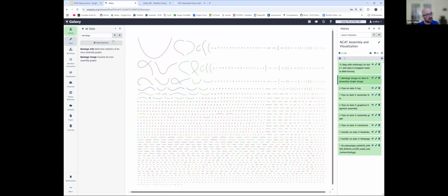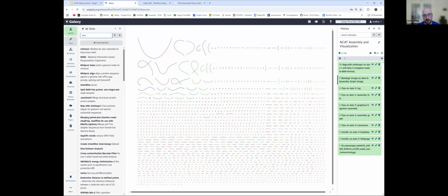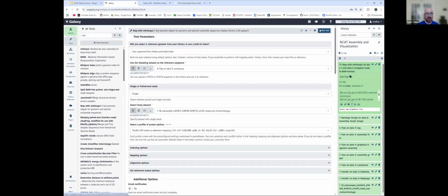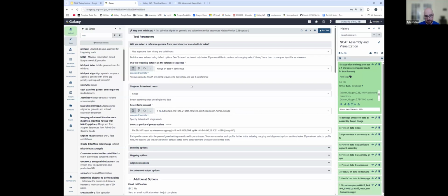So the first thing we need to do is generate a BAM file, because when I moved it down, I did not move the BAM file with us. So we can do that. I guess I'll also show here, whenever you run something in your history, just as an aside, you can always click this little round Ouroboros-looking arrow. That will be a rerun, and it will basically open the tool form populated with every single thing that was used to generate this data, exactly how it was before, so you can see exactly what you used. So very often if something goes wrong, you need to rerun something, or you want to see exact options you chose, this is a nice way to be able to do that.